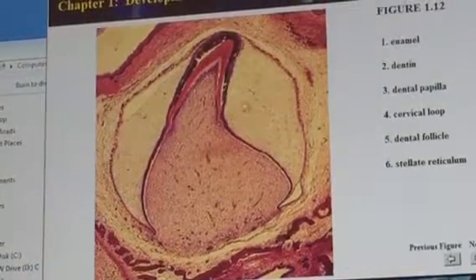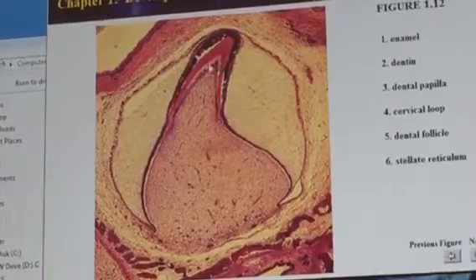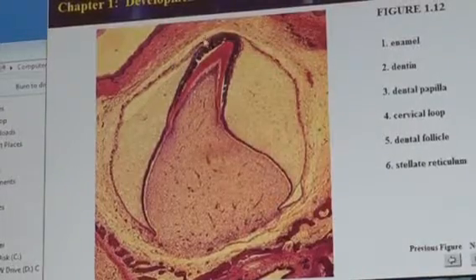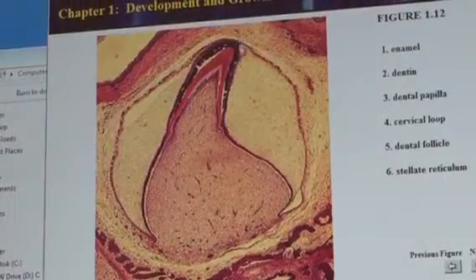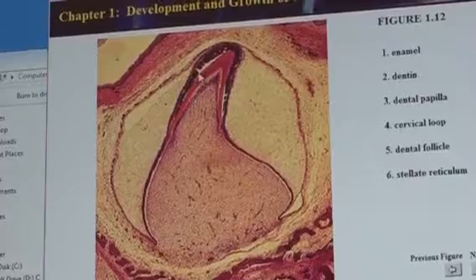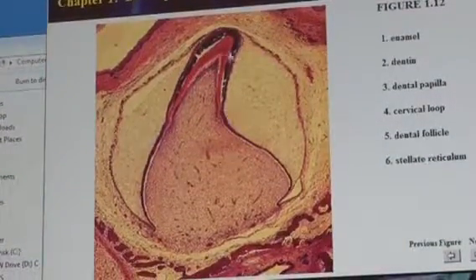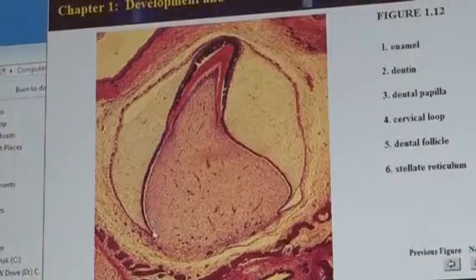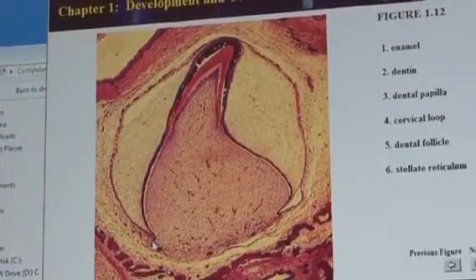Okay, well, late bell stage again, we've got some enamel. We've got dentin, you can see predentin. There's that reduced enamel epithelium that's formed over the top of that cusp. And review that, or recall that all of the mineral tissue deposition is going to occur at the cusp first and then go down towards the cervical loop. And that's going to mark the bottom of the crown.